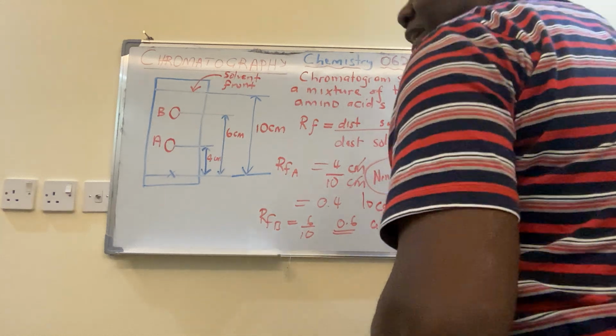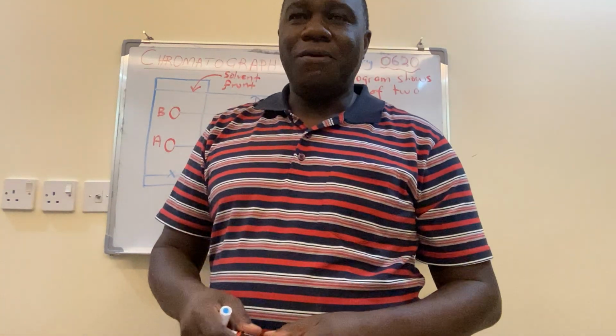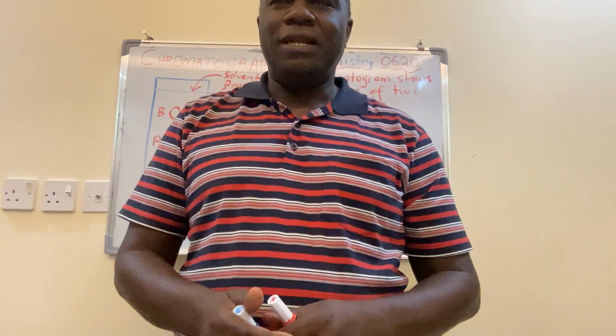So in short, that is what I had for you today: the technique called chromatography and how we can use it to calculate the RF value.